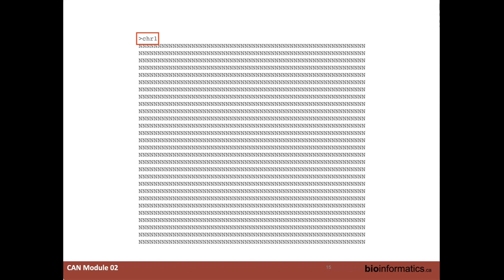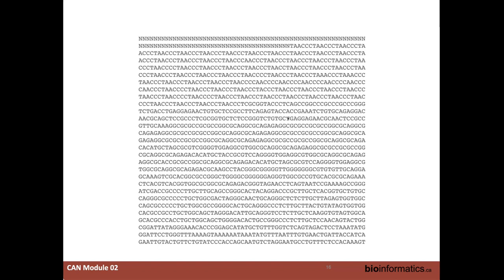But the first time you see this, you're going to freak out, and hopefully you can freak out in front of me and in front of your peers here, and not when you're working with your PI side by side, asking what in the world is going on. So all these N's are just saying, we don't know what's going on here, but somewhere down the line, you're actually going to get some bases that look a little more familiar.